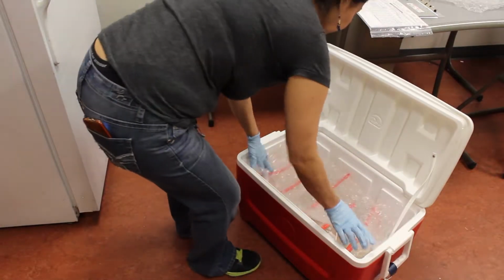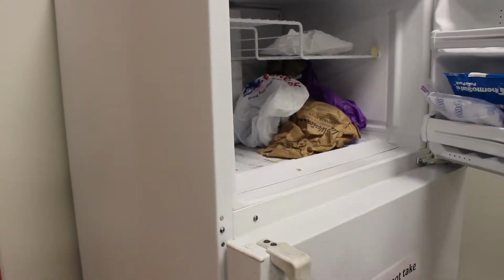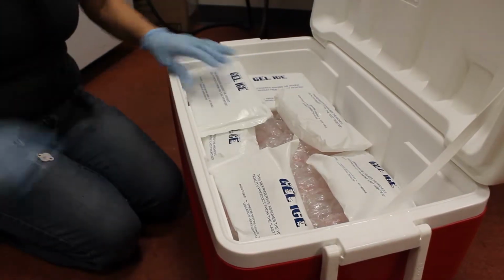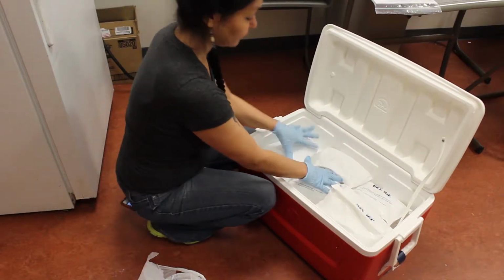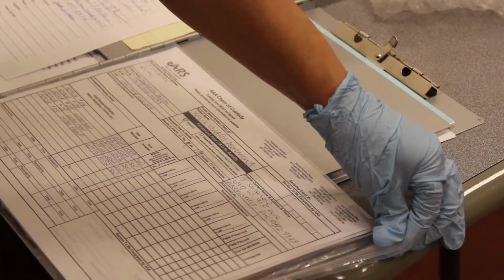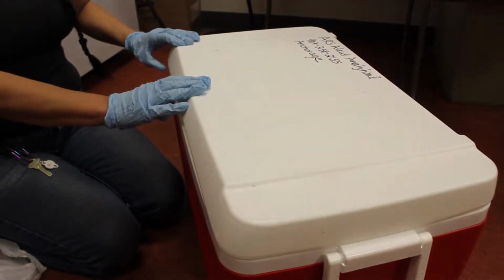Use the bubble wrap provided by the lab to protect the bottles from breaking during shipment. Then place ice packs on top and around to keep everything cool. Try to fill the cooler as much as possible so that things can't shift around during shipment. Usually your lab will send you the appropriate size cooler. Place your chain of custody forms and data sheets in a plastic bag to prevent them from getting wet in case the bottles break or leak. The form should be placed in the cooler last and on top of everything for easy access.